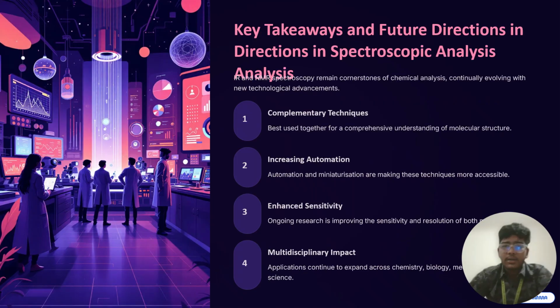Key takeaways and future directions in spectroscopic analysis. IR and NMR spectroscopy remain cornerstones of chemical analysis, continually evolving with new technological advancements. One is complementary techniques, and the second one is increasing automation. Third one is enhanced sensitivity, and fourth one is multidisciplinary impact.